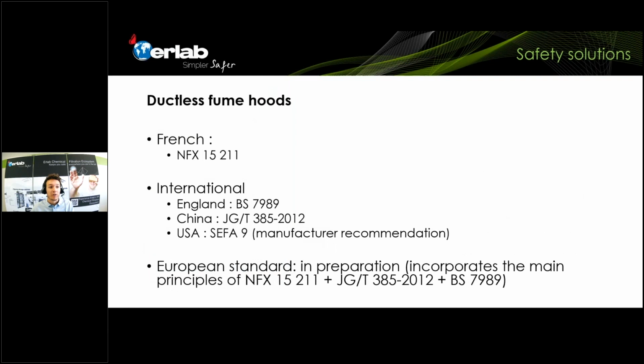Just to give you an idea about the different standards that these ductless fume hoods are exposed to or that they use. Of course, there is one standard that is the most stringent one, which is the French standard, AFNOR NFX 15211. And then there are a few international standards as well, which is one for England, for China, and for the US. There are some people from the US who are as well connected. This may be one of the rules or the international standards that you may know.